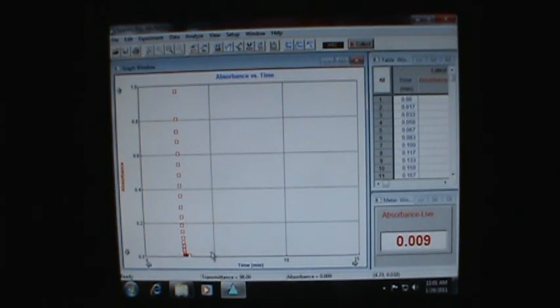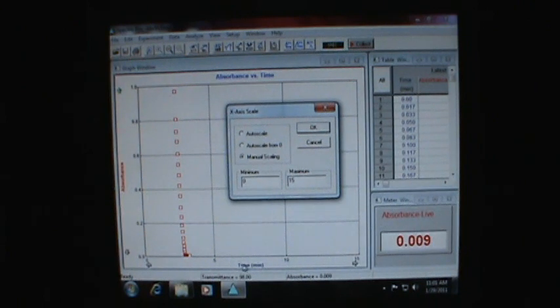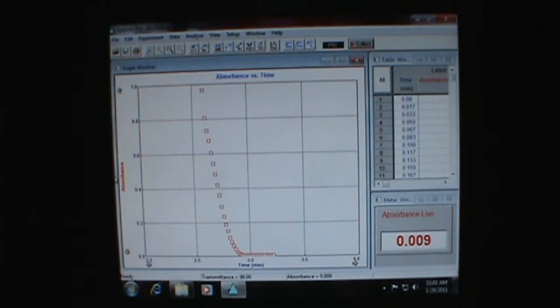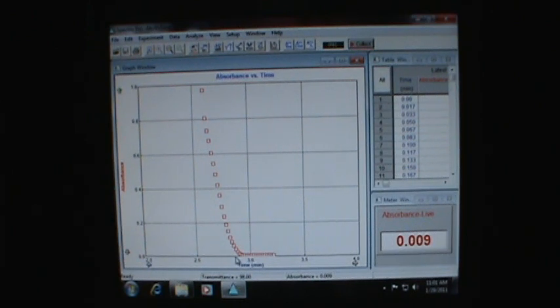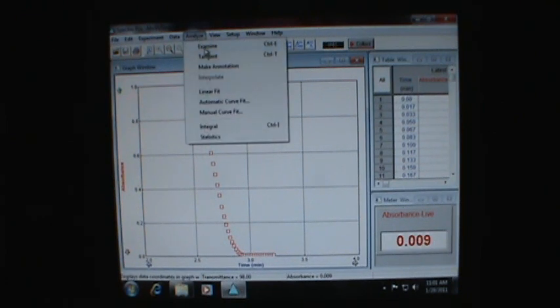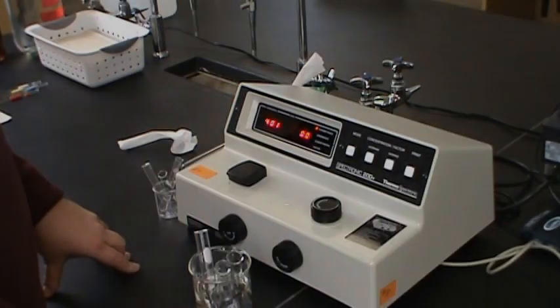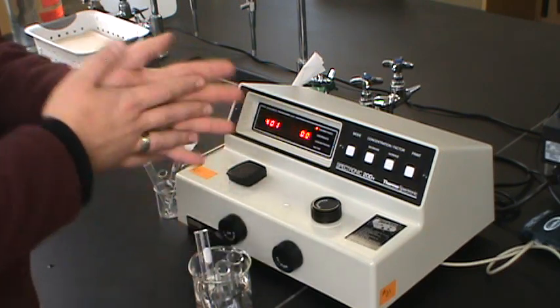If we want to see this data a little bit more clearly in Spectro Pro, if you click on one of the numbers on the axis it lets you do your scaling. Let's scale it from two minutes to four minutes. So there's our data. The time we want is where this flattened out. Just like in Logger Pro, we can go up to Analyze, Examine, and it's giving me each of my individual data points. Looks like about 0.009 is about where it should be. So it took somewhere around three minutes for this experiment to complete. Now we just need to clean out that tube and we can go ahead and do another run or two.